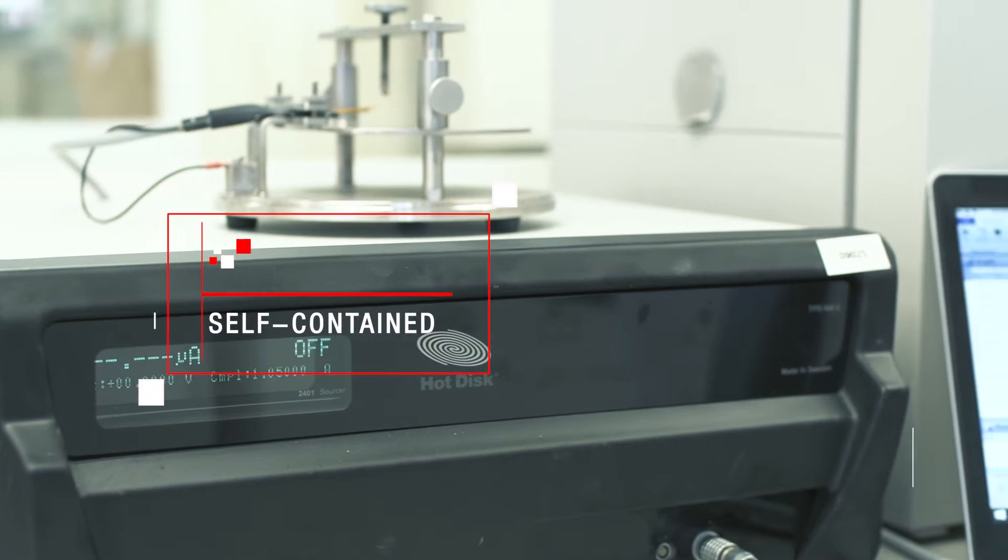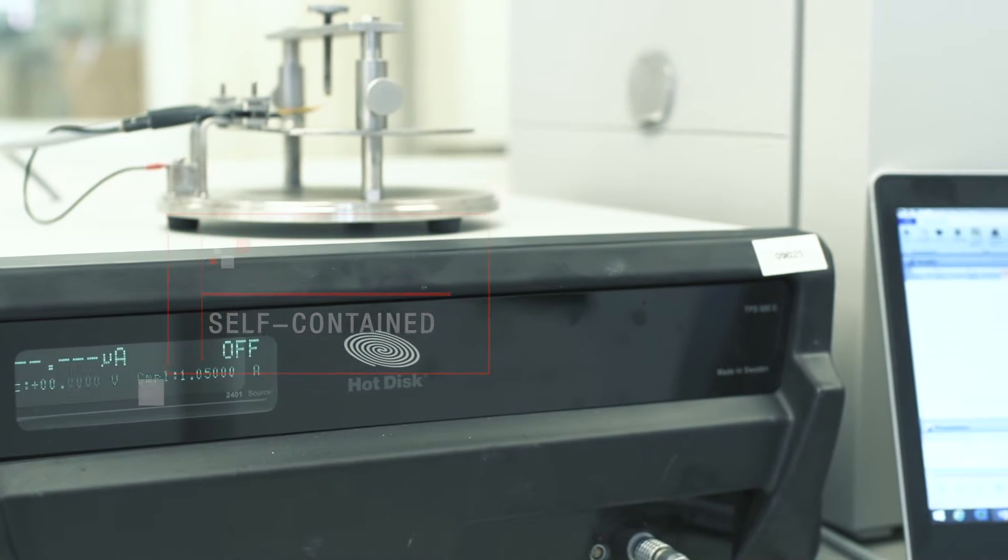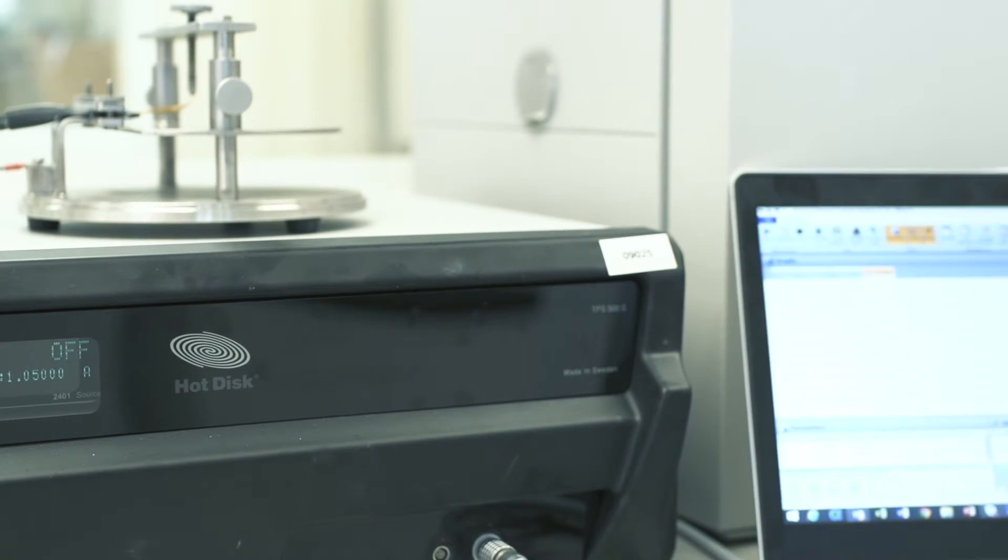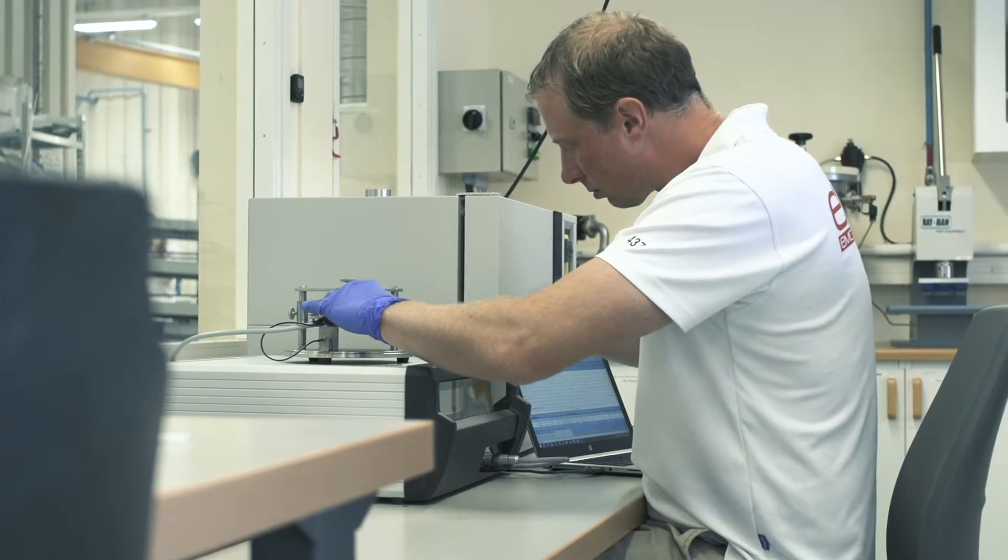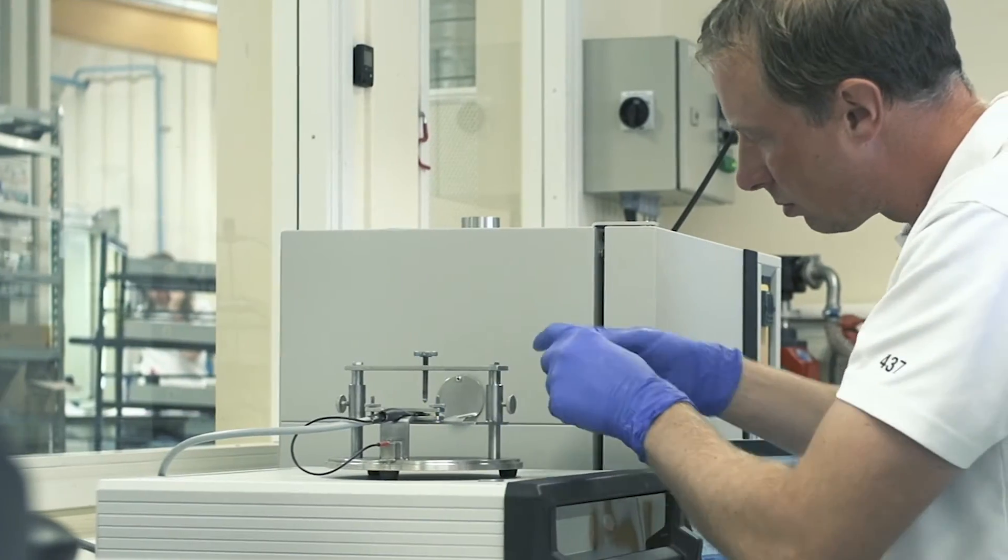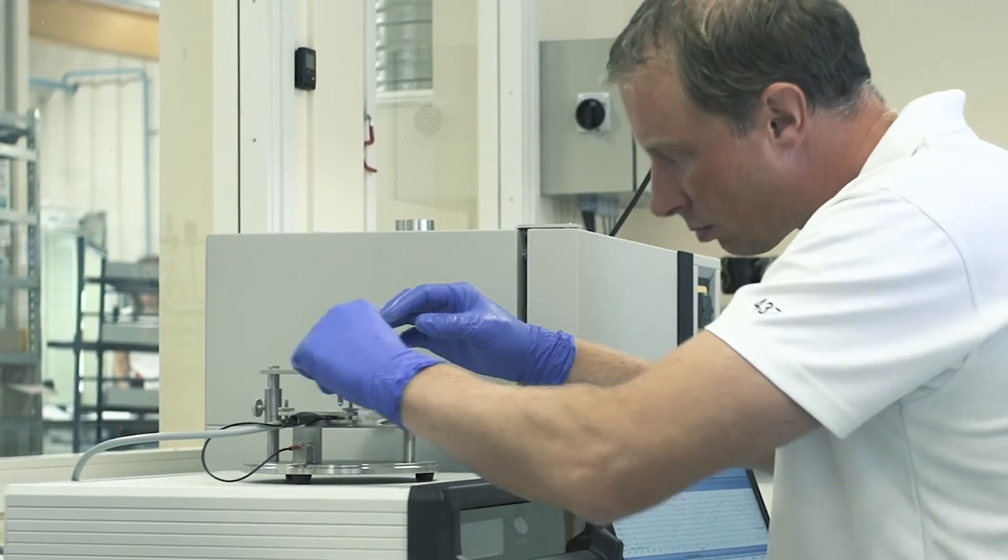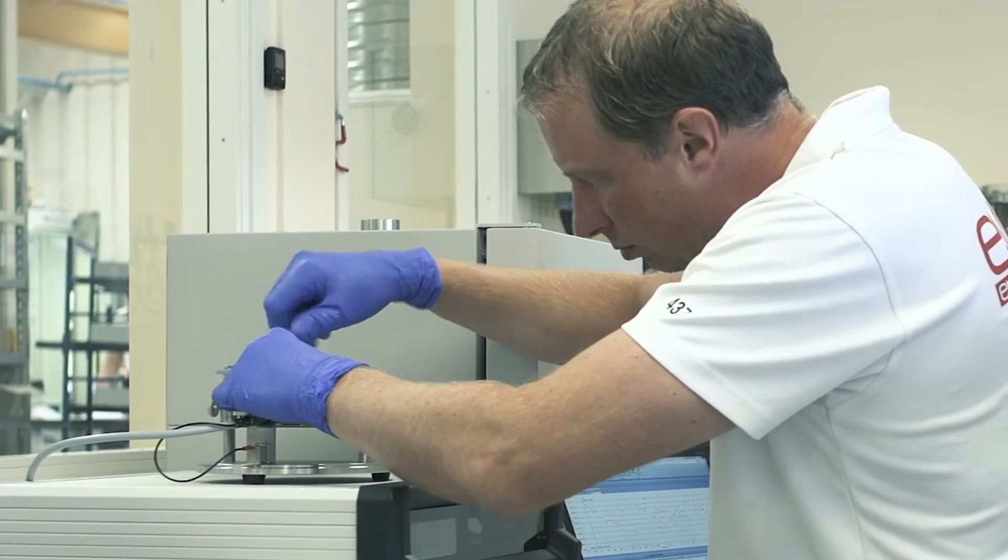Unlike ASTM D5470, the hot disk method is entirely self-contained, in that neither the sample itself nor the test equipment is subject to any other factors, such as surface or positioning tolerances, radiative or conductive heat losses, that may have a significant impact on the test result.